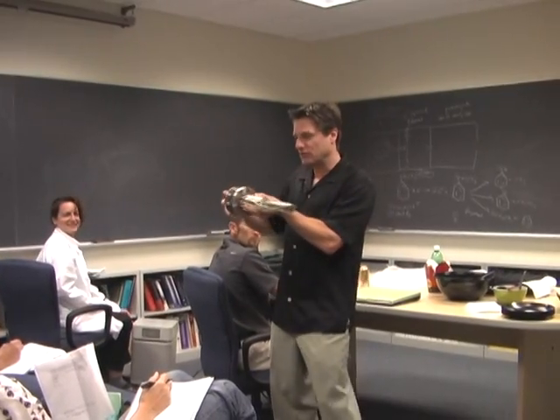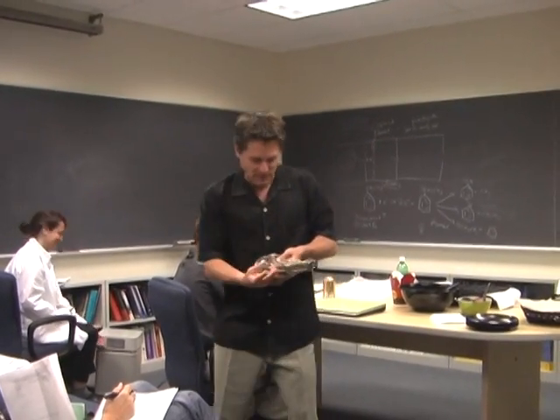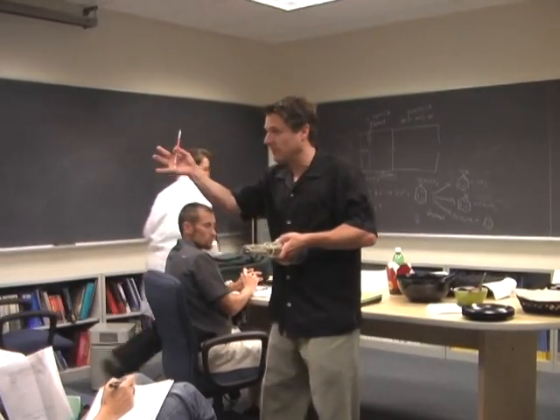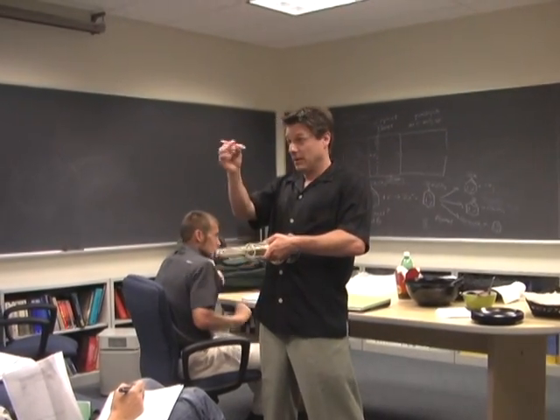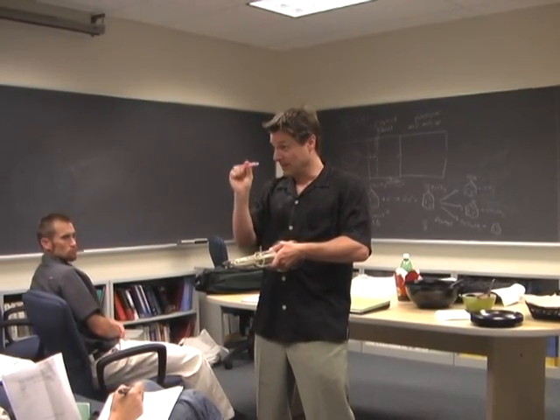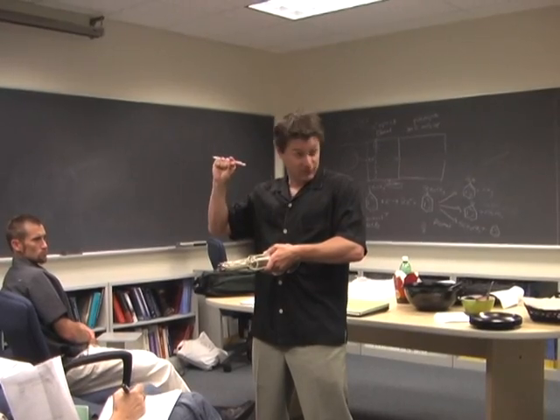So this goes into the system here, and it'd be nice to be able to pull this apart, but there are 4 rods in here. Imagine this is a metal cylindrical rod, right? There are 4 of them. There are 2 like this, and we're going to have those both positively charged. And there are 2 like this, and we're going to have those both negatively charged.